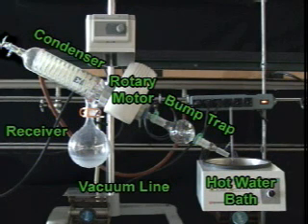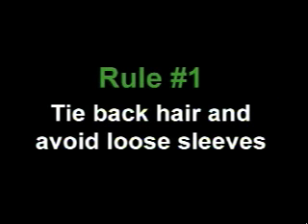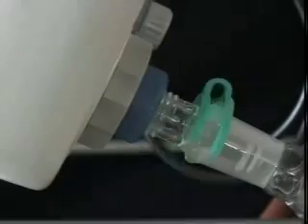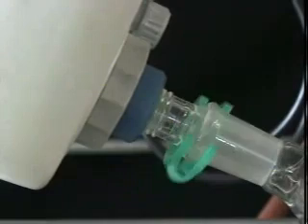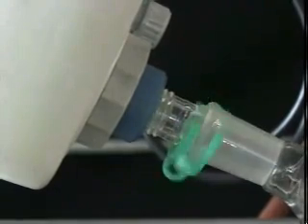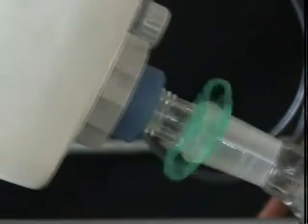Rotavap operation is very simple, but there are a few guidelines that you need to follow to avoid some potentially painful mistakes. Rule number one, tie back your hair and avoid loose sleeves. The rotary motor on the Rotavap is a potential safety hazard. Take care not to lean too close or dangle your hair, clothing, or jewelry near the motor. Otherwise, you may end up saying a painful goodbye to some precious material, maybe even your scalp.